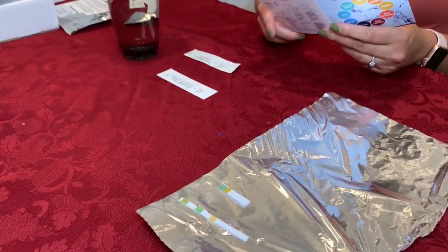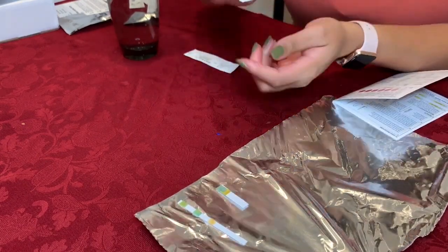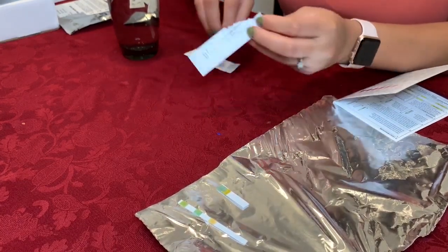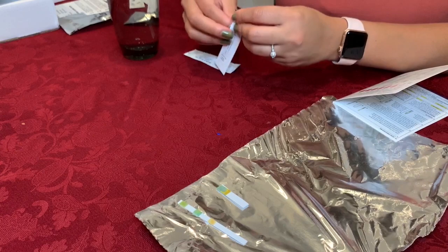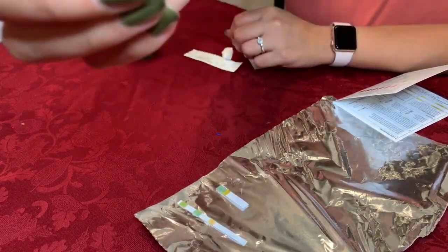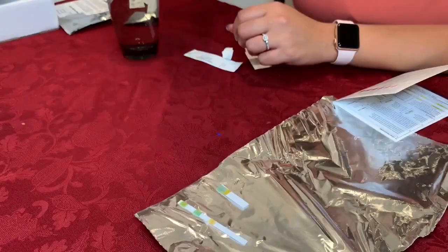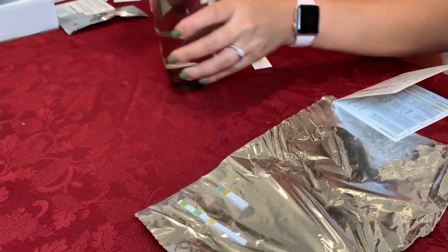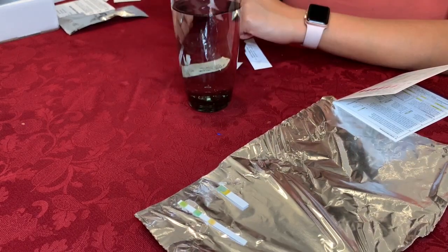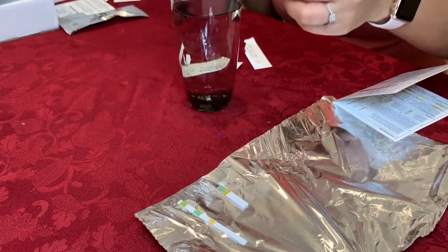Next is the copper check. This is the copper strip, and we just open it up. Take our glass of water — this is what it looks like, it's pink. And just dip it into our glass of water for 15 seconds. Okay, that looks good. 15 seconds done. And now we wait 30 seconds.